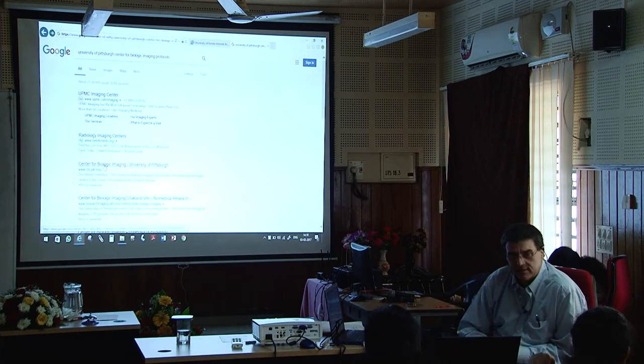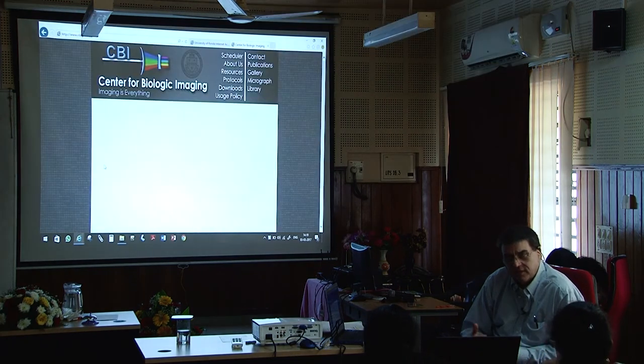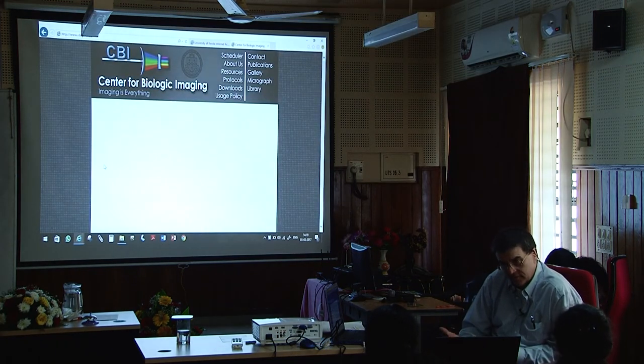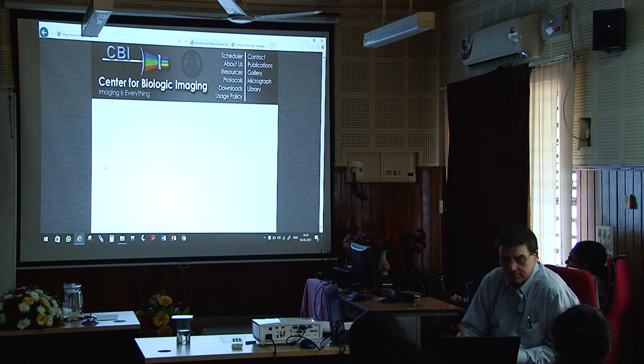So any questions about staining? You see the protocols are fairly repetitive. Even though it's tissue, even though it's cells, there's not a whole lot of difference. Fix, block, stain, wash, keep everything wet.